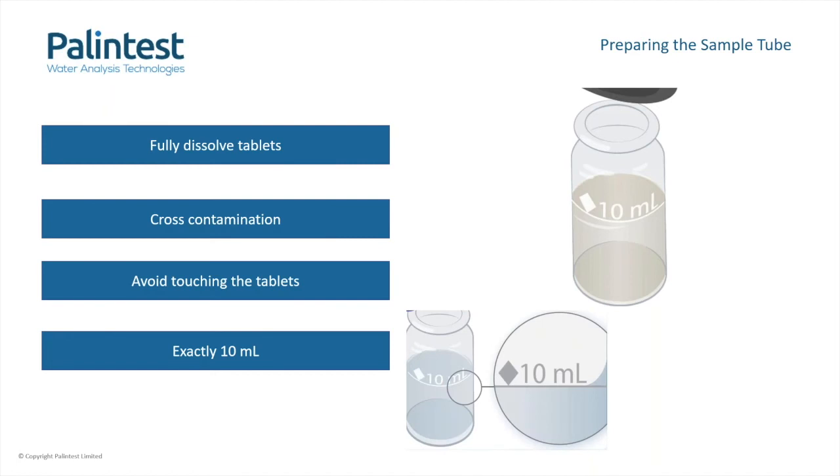The curved surface of the sample, called the meniscus, should just be resting on the white fill line. Better still, use the 10 ml syringe included in our kits. Again, rinse it many times with sample to ensure that it is clean and free of contamination.